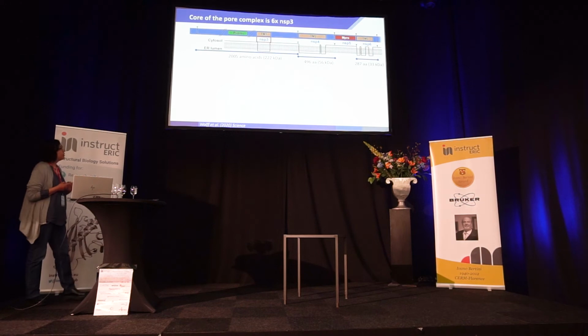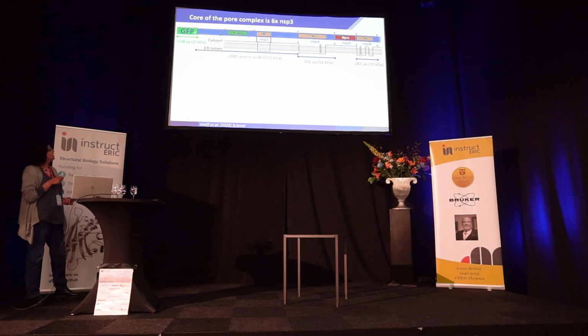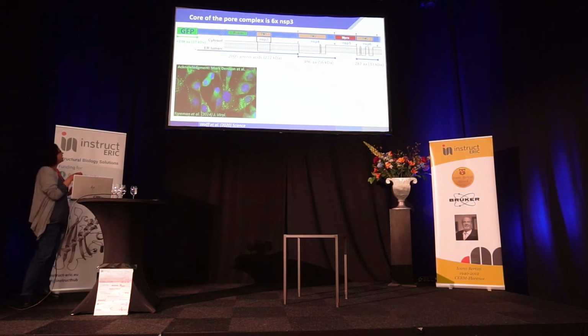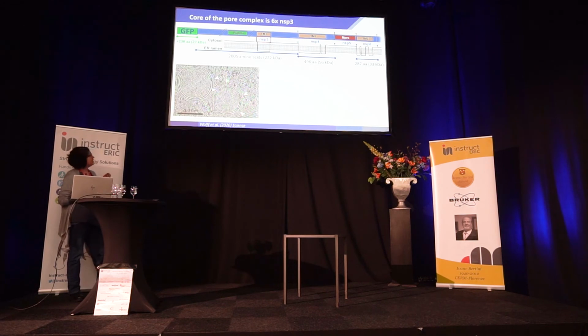Okay, so we thought that these transmembrane proteins were also likely candidates to be part of the core, and in particular NSP3, the first one, which is very large for coronaviruses. And to investigate this hypothesis, we used a recombinant virus that has GFP fused to the N-terminal domain of NSP3. This virus was developed in the lab of Mark Denison to follow infection by fluorescence. And for us, the fluorescence was not so important as the extra almost 30 kilodaltons that this fusion tag will add to NSP3. So we repeated the same workflow.